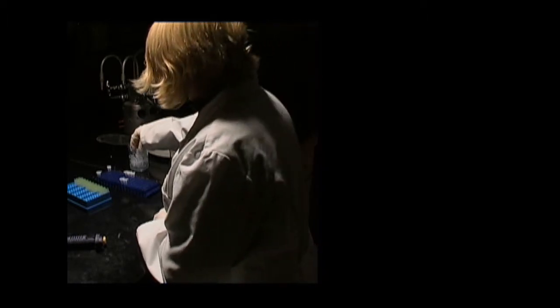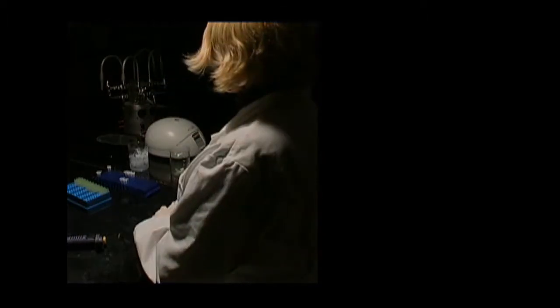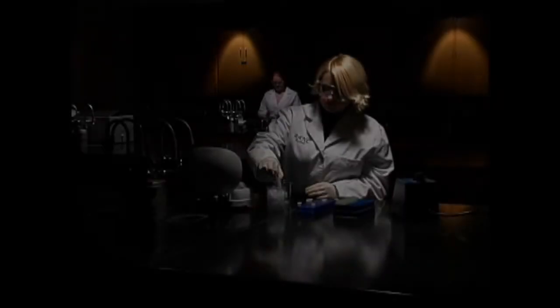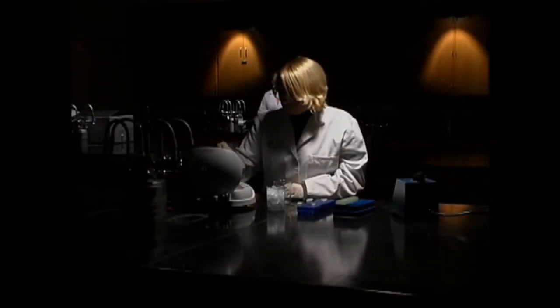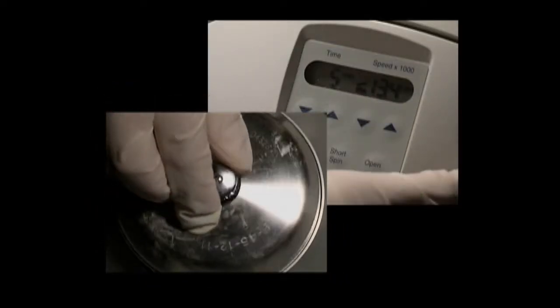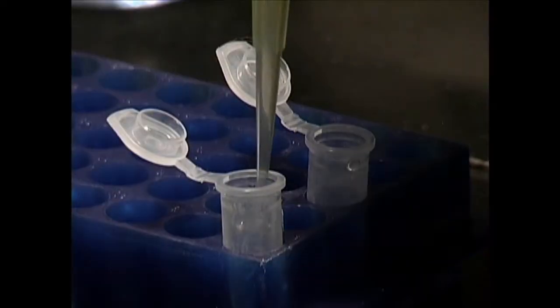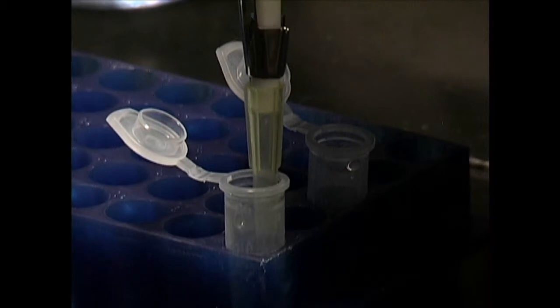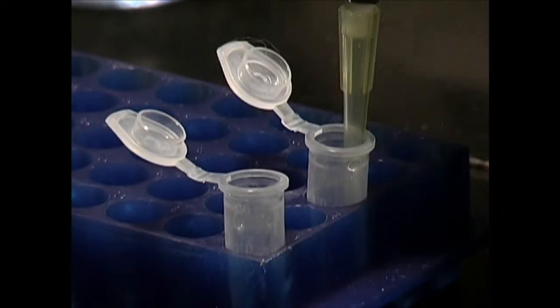Ice the tube for 4 more minutes. Place the tube in a microcentrifuge, and run it at full speed for 5 minutes to facilitate the precipitation of unwanted fragments. When it's done, a pellet of unwanted fragments should have formed at the bottom of the tube. Pipet 0.5 milliliters of the supernatant into a fresh tube. This will contain plasmid DNA.